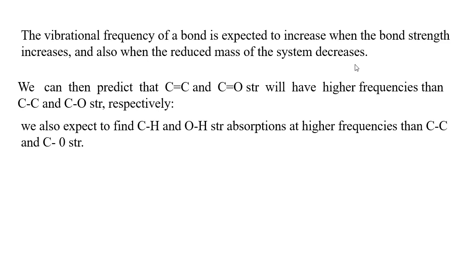Thus, we can predict that C double bond C and C double bond O stretching will have higher frequencies than C single bond C and C single bond O stretching respectively, because C double bond C and C double bond O have higher bond strength than C single bond C and C single bond O.